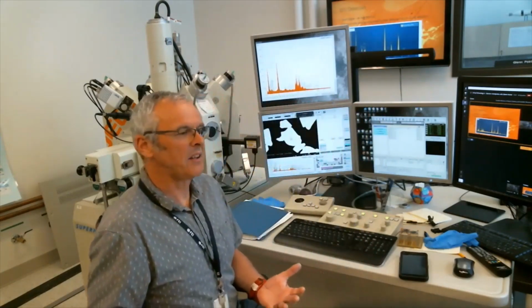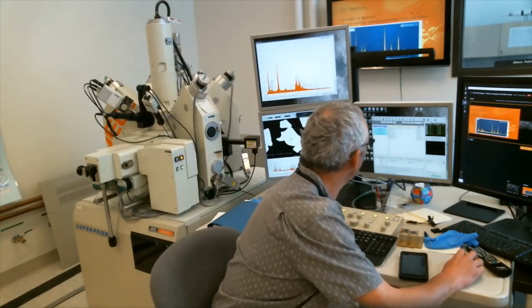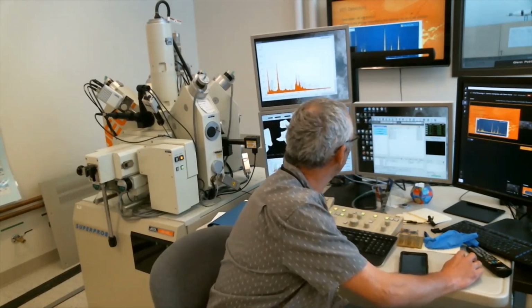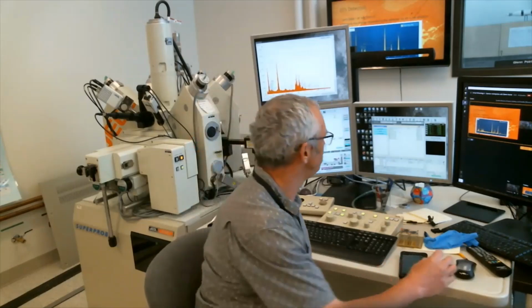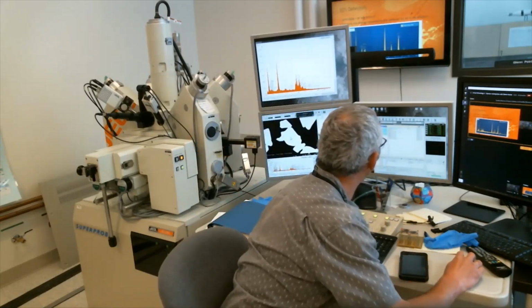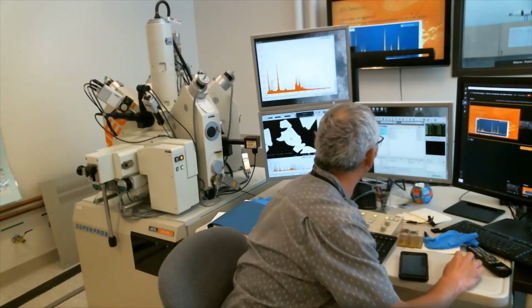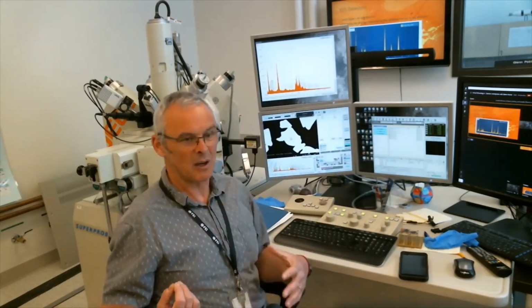So this is what an X-ray spectrum coming off a sample looks like. We have all these different X-ray lines, and because we know, for example, as I said, an iron K-alpha X-ray has an energy of 6.4 keV, we can identify that line as iron. A nickel X-ray is at 7.5, somewhere around there. Copper is 5.4, or chromium is 5.4. And normally this is done now by the machine, okay? The machine will see an X-ray photon at that position and identify that line for you.